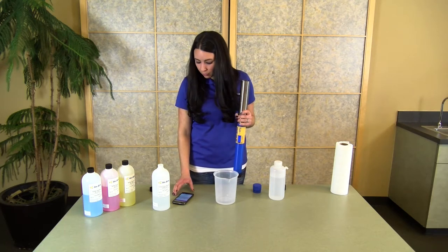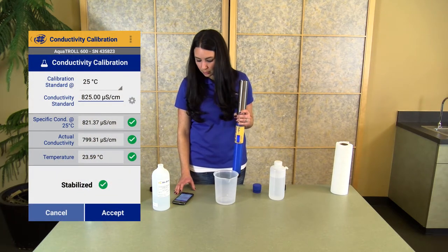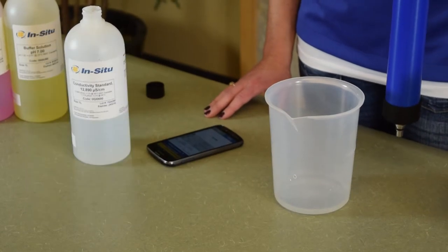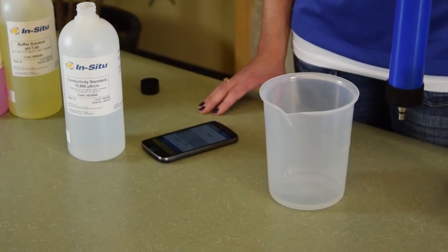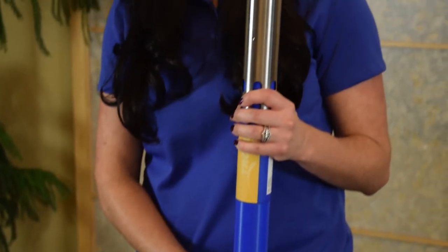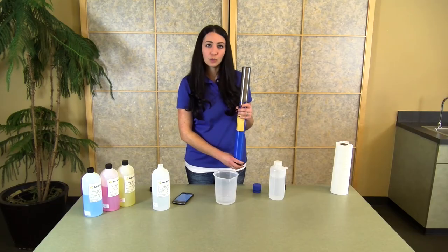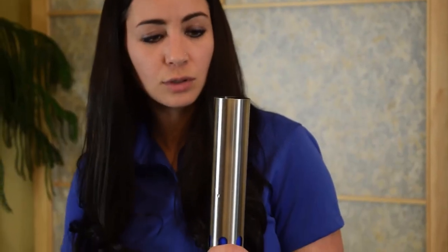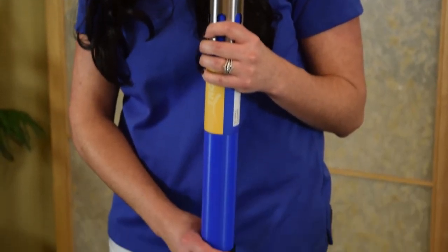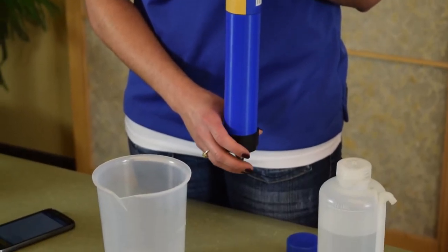The app will give you updates based on how stable the calibration is and when you're ready to accept. Once you have three green check marks, click the Accept button. The instrument will write that calibration information to the sensor itself. All calibration information is stored on the sensor, so no matter what instrument you have the sensor installed on, you can transfer the sensor from one to another with the calibration information following the sensor.